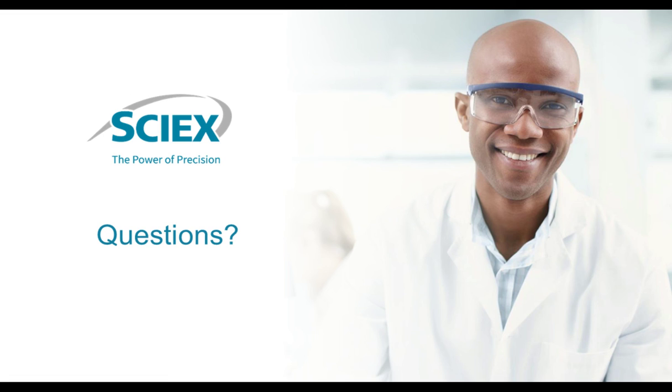Handy, for the corrected area, will Empower calculate the TCA to give the same value as 32 Karat? That's another good question. In the calculated area, it should give a similar value. It will not be exactly the same, but it should be very similar to that of the 32 Karat.